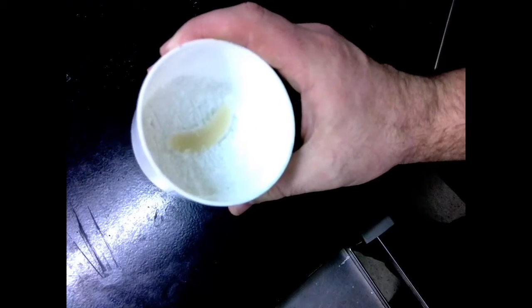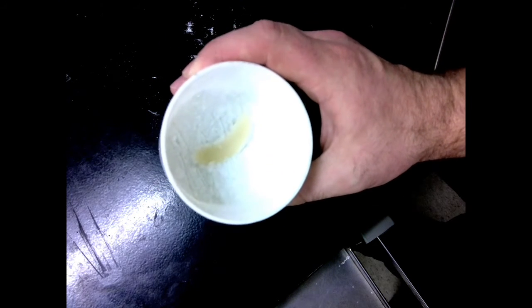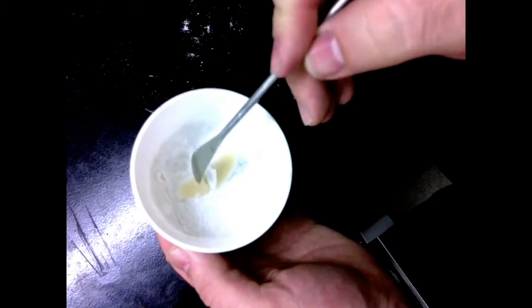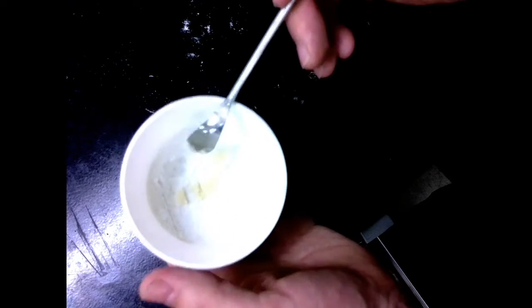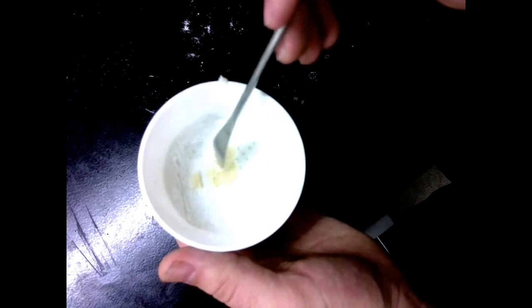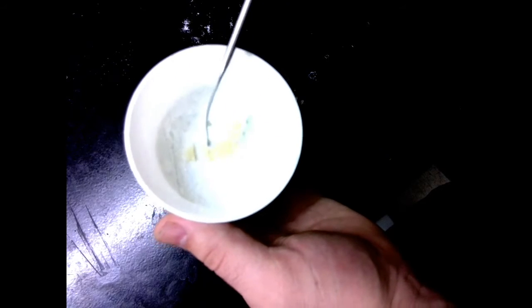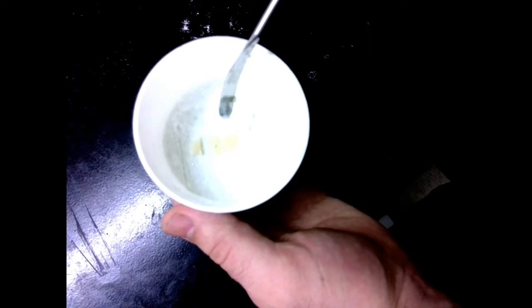So we can see that I've got quite a bit of aspirin in my Buchner funnel here. So my next step is I need to do a recrystallization, because I can see I've got a lot of white powder here, but I've got this weird brown stuff. And when I do a recrystallization, I'm going to be able to use a solvent that's going to pull all of this discoloration away and leave me with pure white crystals. So I need to do that using a mixture of ethanol and boiling water. So let's take a look at our next step.